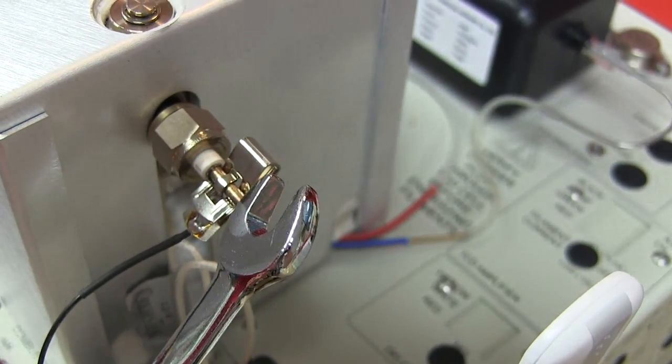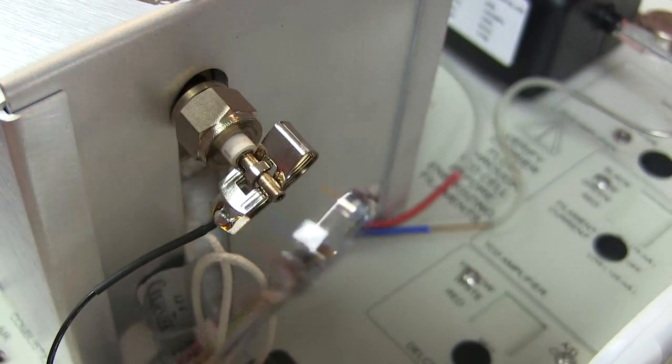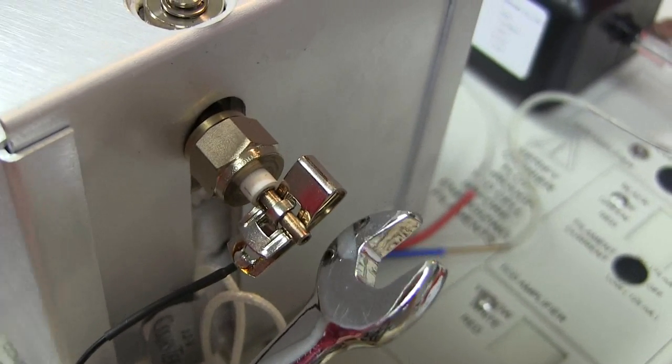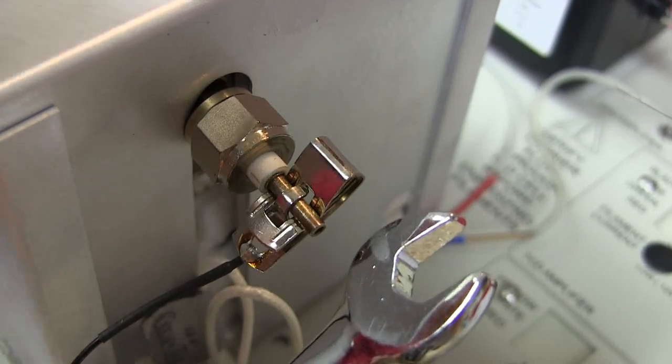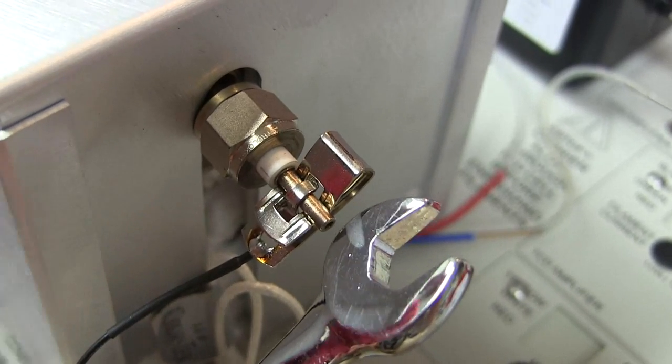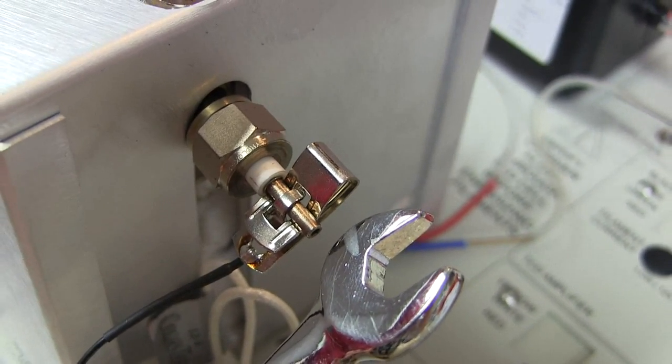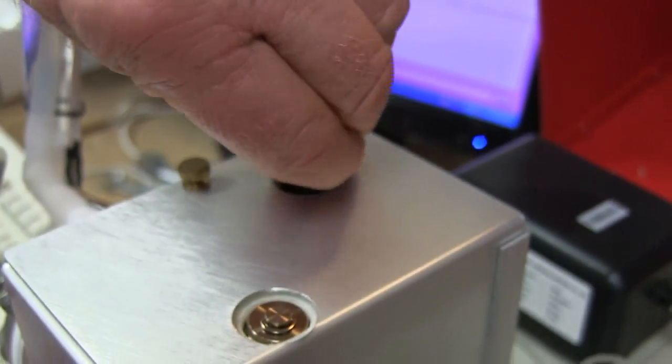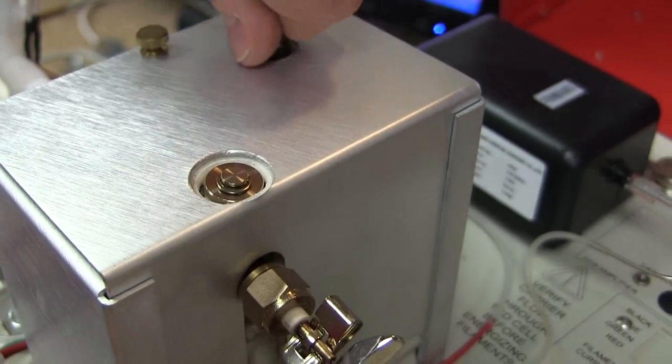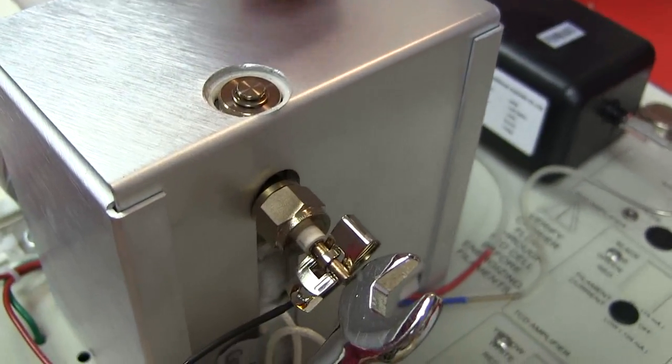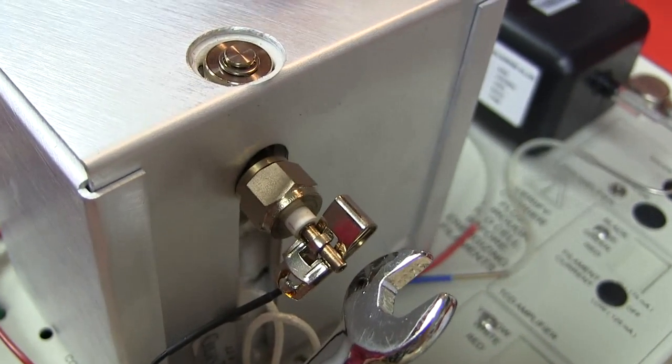If I loosen the septum nut, watch, the flame will go out because all the hydrogen will leak out here instead of going through the column and ending up at the detector. So as soon as I put the septum with the septum nut on and tighten it, you'll see the flame will spring to life and the condensation will reappear.